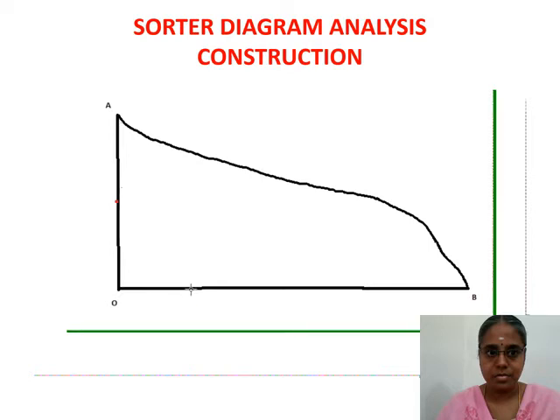This is the sorter diagram, which has O, A and B.